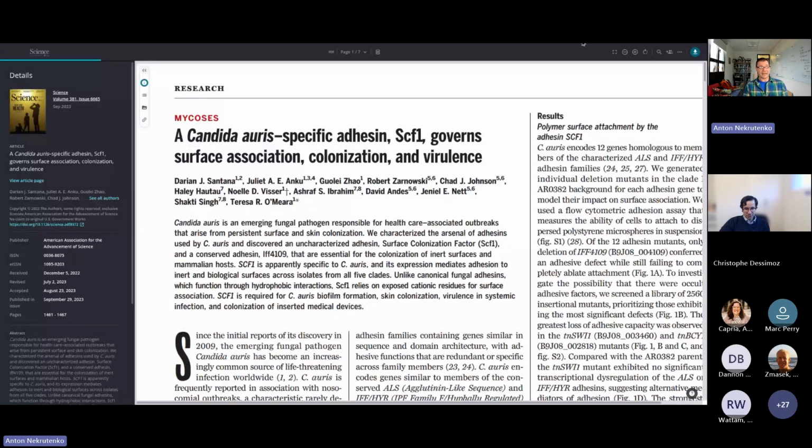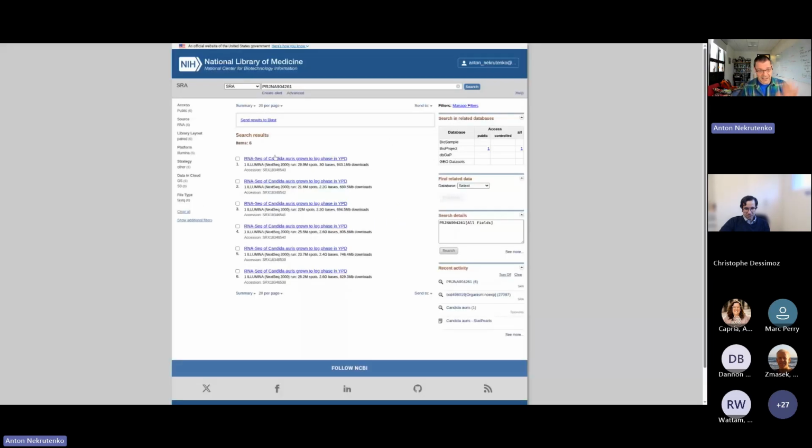So for this paper, data is deposited in NCBI, everything is good. It has a project ID, which is listed in the paper. I just have it here so I don't forget what it is. So I want to replicate this via BRC Analytics. I already found the genome.